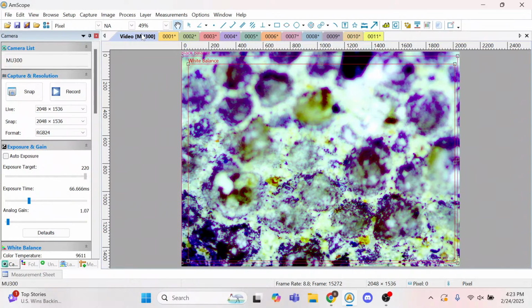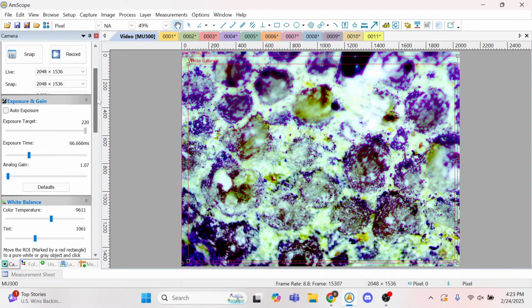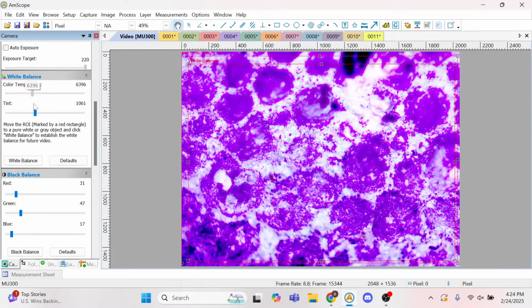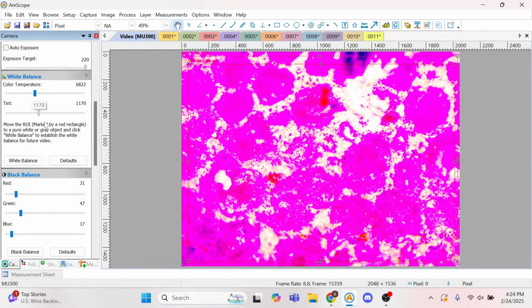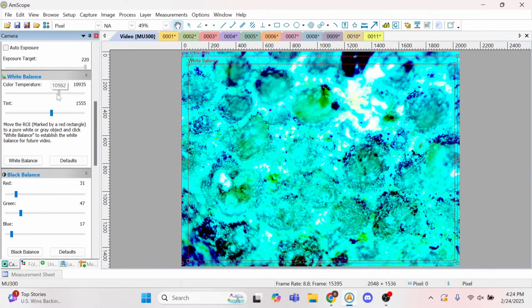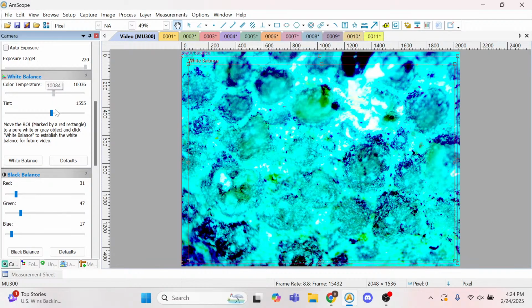Yeah, this is fairly close to the actual color of the object I'm looking at. I can make this all kind of colors that I want. I can go pretty wild with this if I desired to. Although the whole point is photography, and you can't really tell when it's cyan like this, you know?